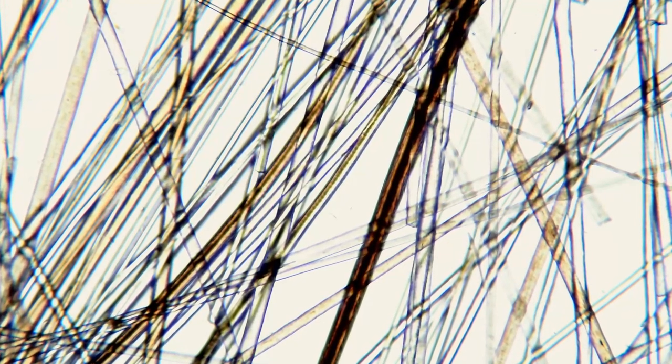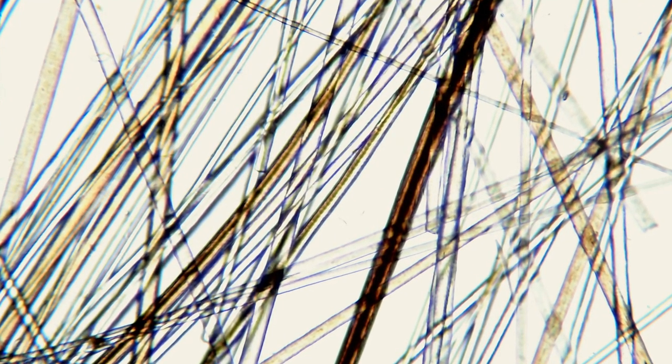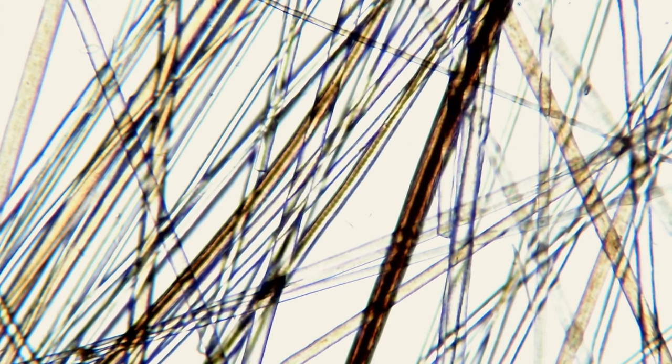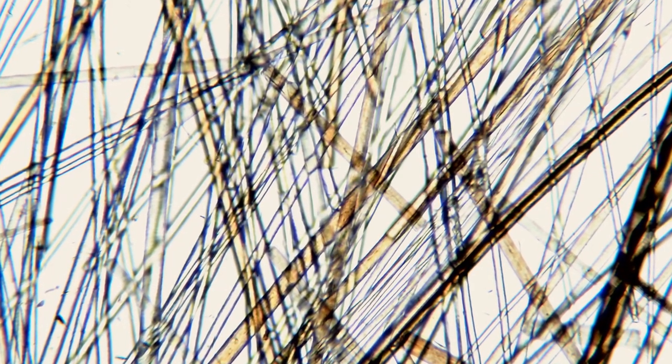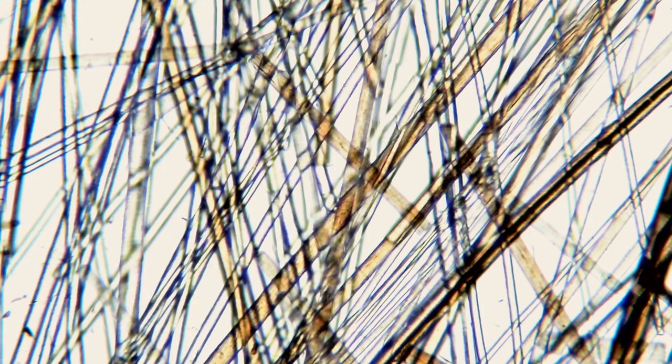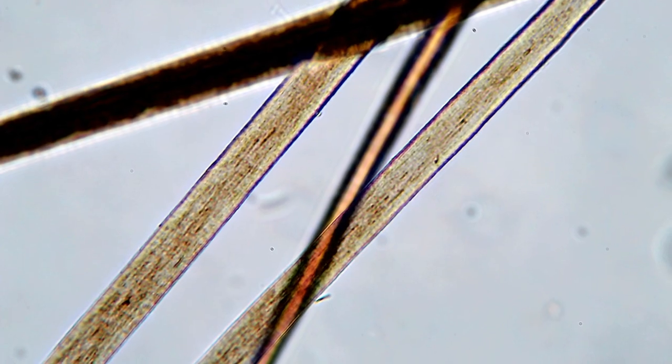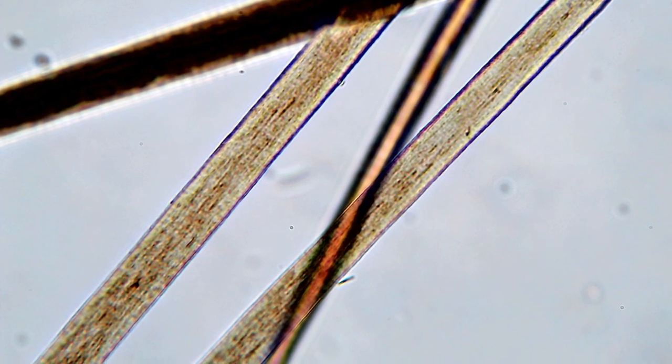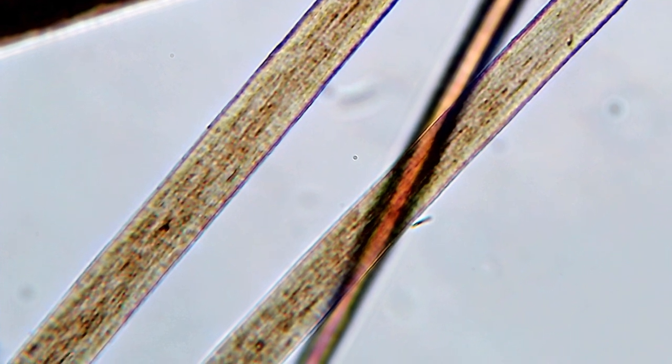And last but not least again a picture within bright field showing very nicely the different colors and the different diameters and thicknesses of the dog specimen fibers. So as you can see microscopy is quite interesting. There are many things that you can see and that's actually quite a nice one. You can see the texture quite well.